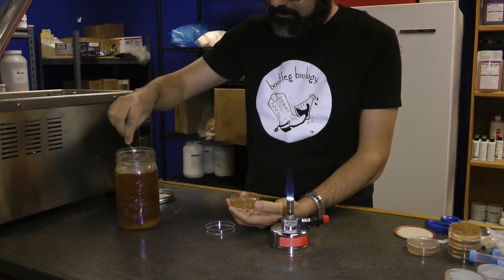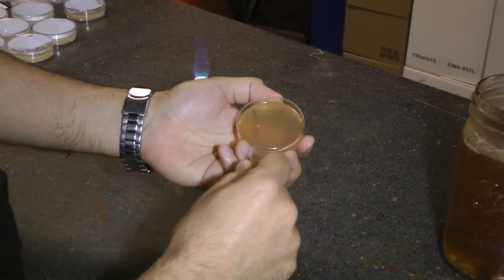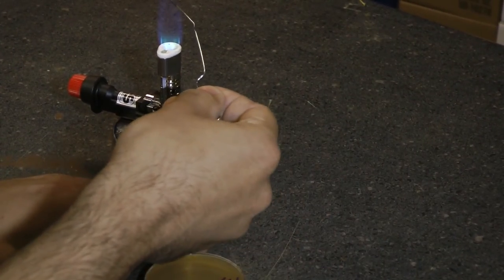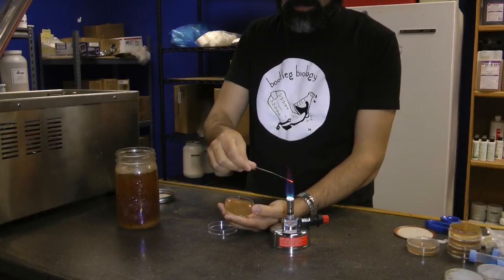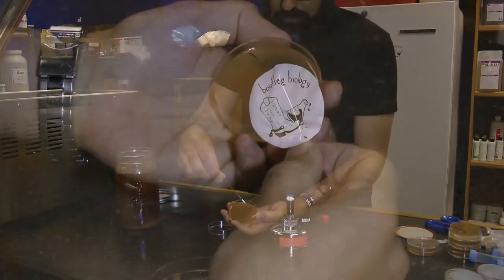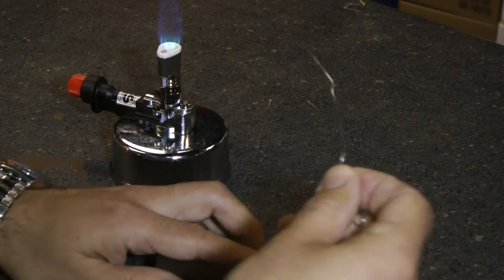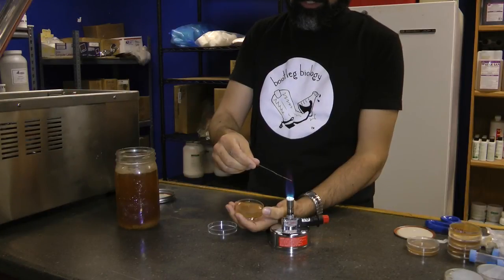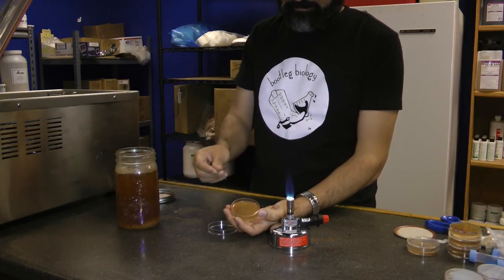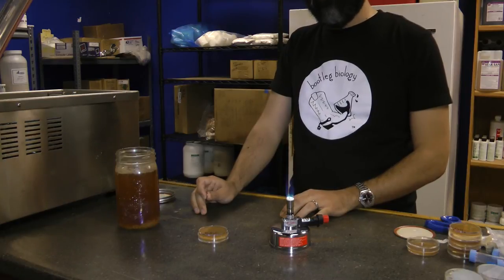Let it cool down for a moment, then dip it into your yeast source — here's the wild yeast starter jar. Then you're going to make three streaks on one side of the plate. Now you need to sterilize the paper clip again. The goal here is to thin out what you've already put on the plate. Grab the very end of the three streaks and streak it three more times, and then repeat it again. Keep on streaking until you've done this four times and you've covered each side of the plate. Then turn it upside down, put it in a warm, dark place, and let it incubate for a few days or maybe even a week.